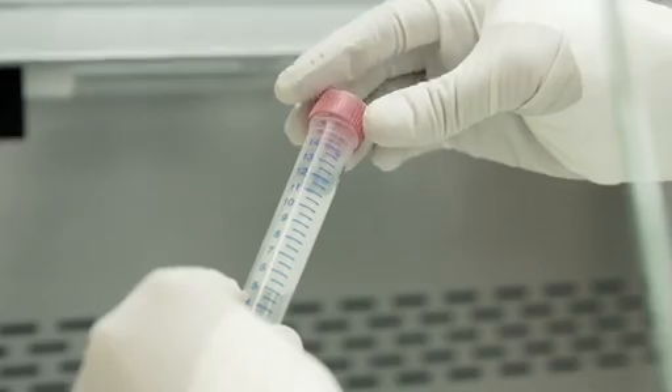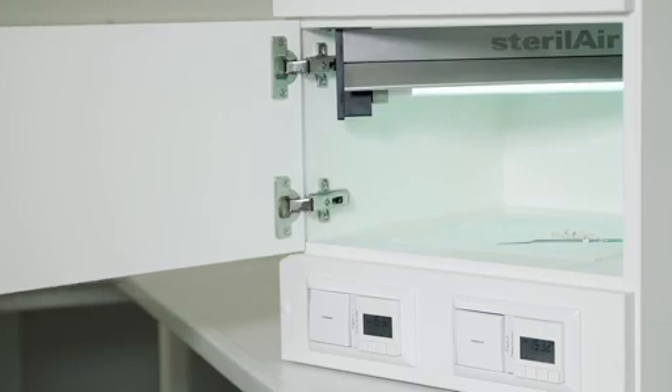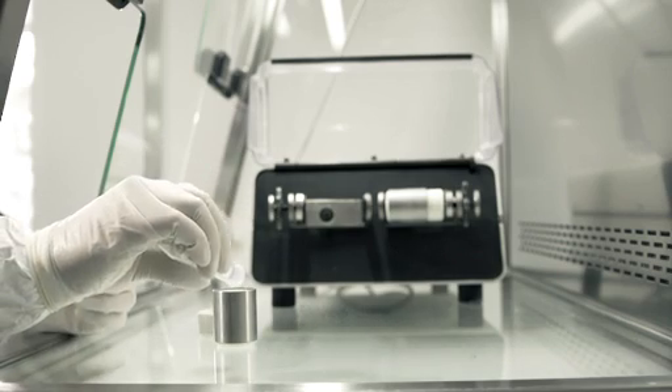We then put the remaining sample in a UV light box. We mill and pulverize the bone or tooth sample to make the DNA inside more accessible.